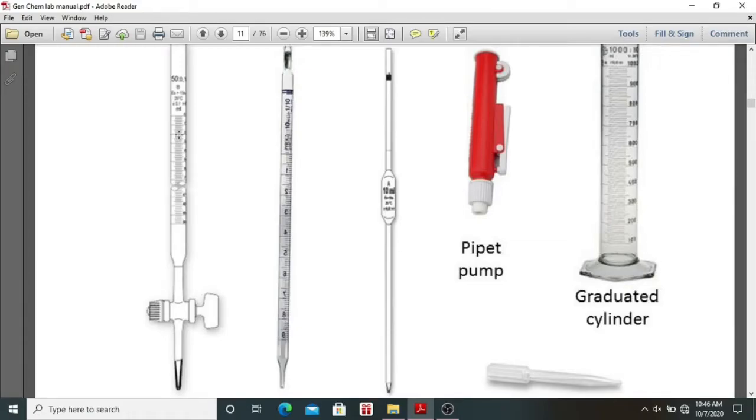It has an accurate, or precise, amount of volume of liquid. If you are adding liquids to a container, it's a precise volume of that liquid. The volume of liquid added can be determined to the nearest 0.01 ml with practice.